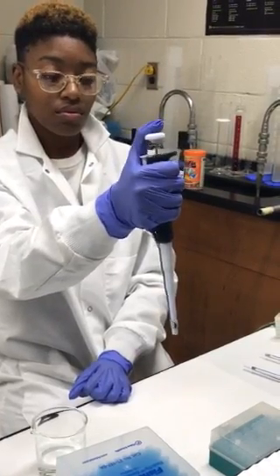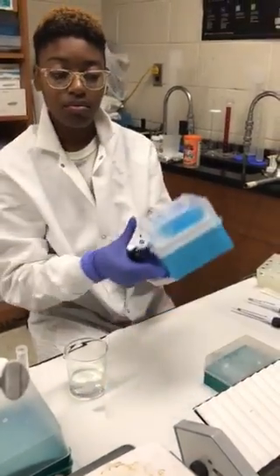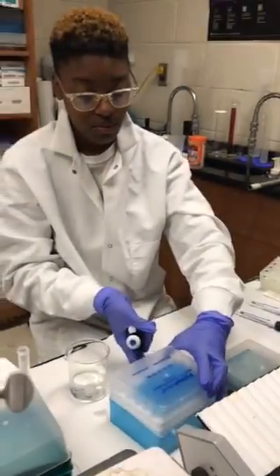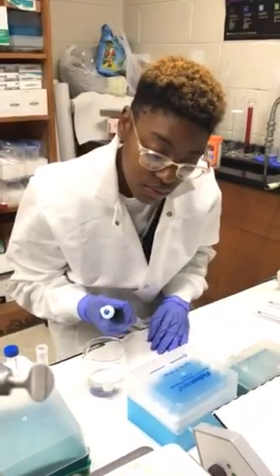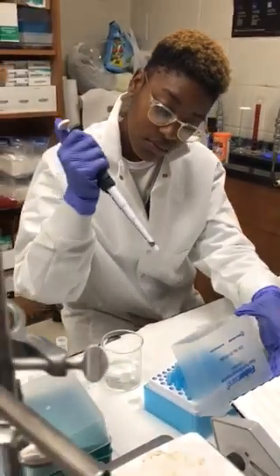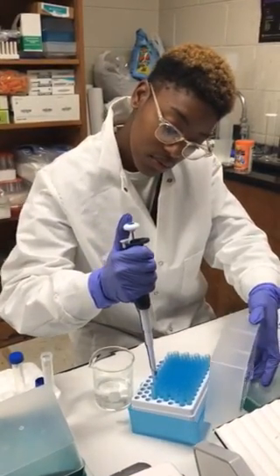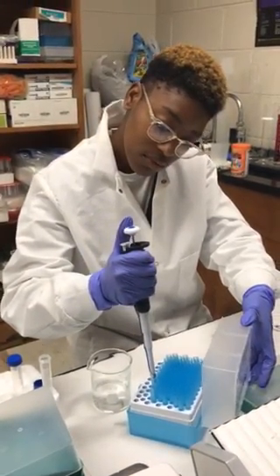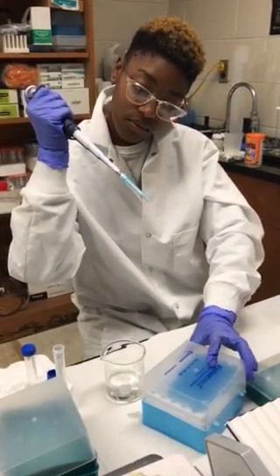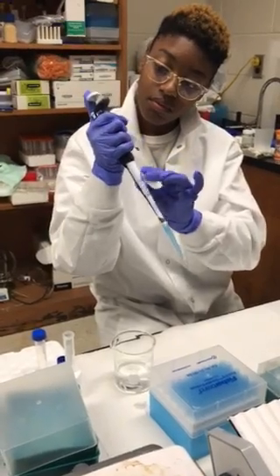Applying the tip, make sure your tips are sterilized in their proper container. Each tip is labeled by its range for the maximum volume of the pipette. When applying the tip, be mindful not to force the tip, but press firmly to secure the tip onto the pipette. Forcing the tip, you are at risk of damaging the pipette. Be aware of handling the pipette because solution could be contaminated.